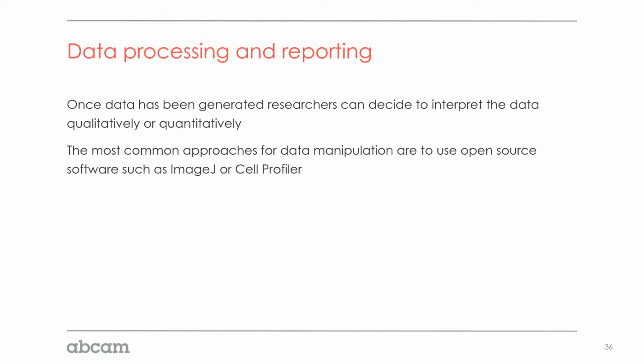Again, interpreting this data is a bottleneck for a lot of researchers. However, there are lots of resources through Cell Profiler and ImageJ that allow you to use open source and free tools to process that data, and there are a number of publications that help you understand which macros and plugins to use for specific research questions. This varies greatly, from just getting a great three-dimensional rendering to analyzing how a vasculature network in a brain works.